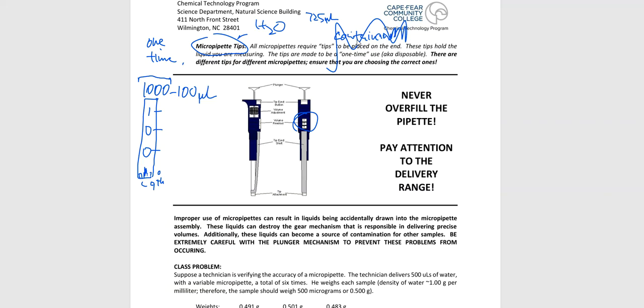Okay? All right, well, if that's the case, if I dial this up, because that's as high as it can go, it can't go any further. 1,000 is the cap, 1,000 is the max. Well, if I dial this into 0, 7, and 3, what is that number? That is not 73 microliters. That's going to be 0, 7, 3, 0. Again, if that tick mark lines up with the 0 down here at the very bottom. So in other words, that would be 730 microliters on our larger micropipetters.